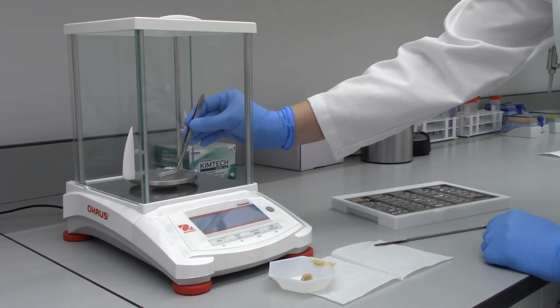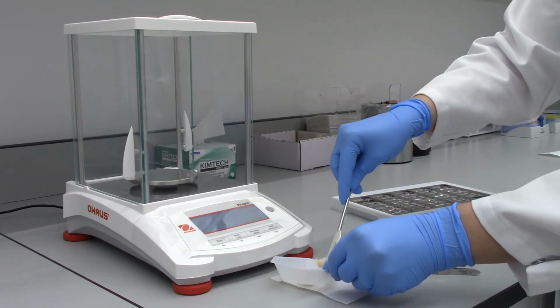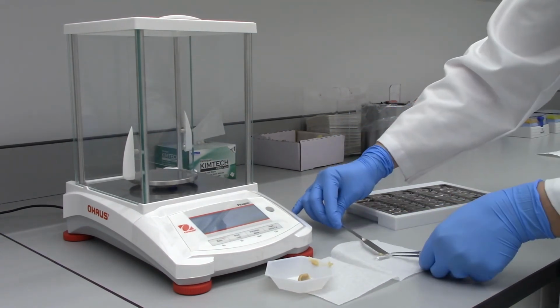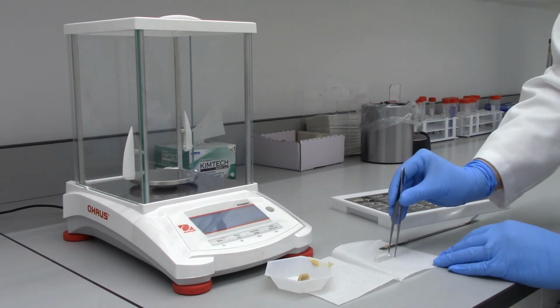While the liquid samples are running, we can go back to the lab and start preparing the solid samples. Here all we have to do is weigh them accurately onto quartz boats, and we do not need new calibration standards. We will continue using the calibration that we've just established.